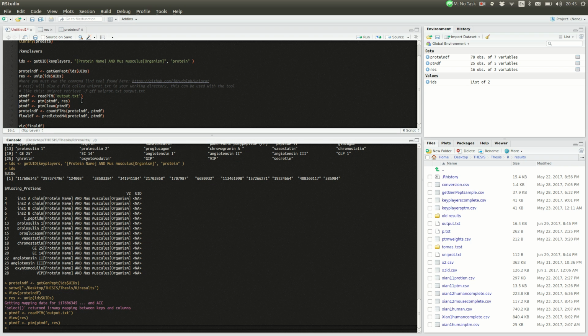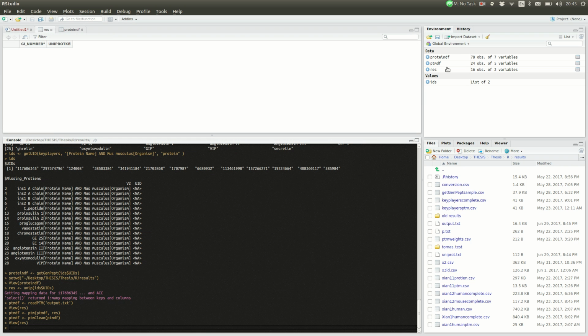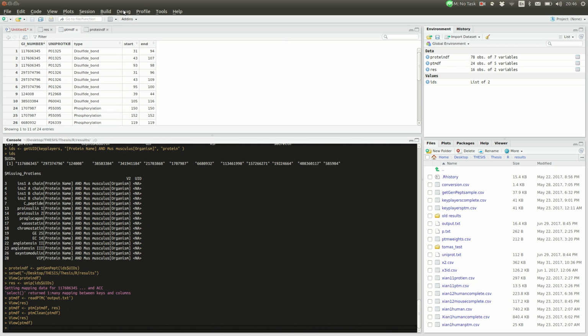Then we're going to clean up this data, which I'll let you see here.